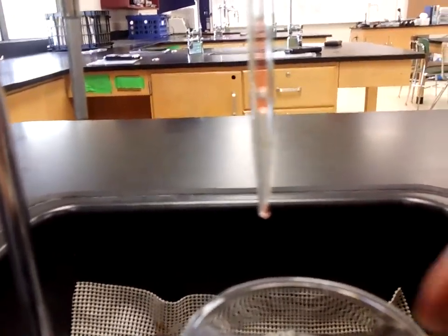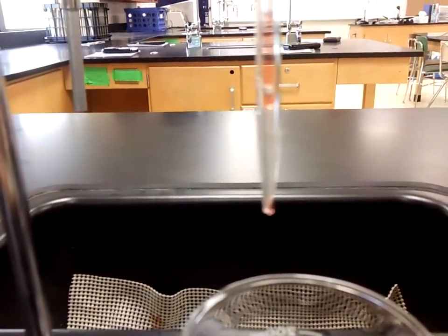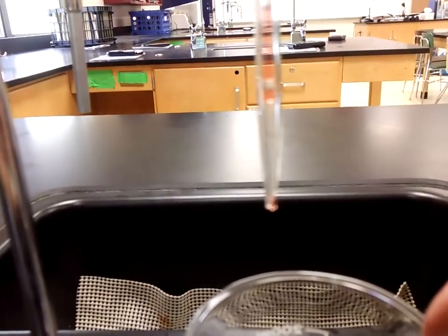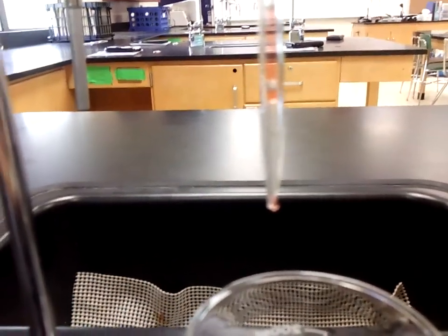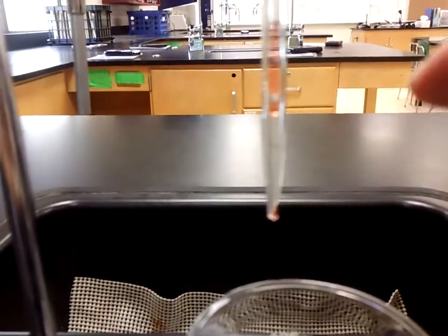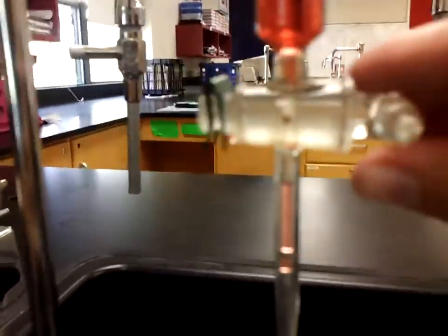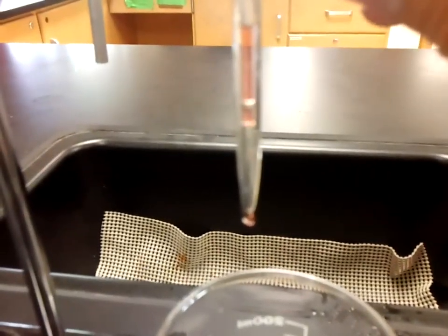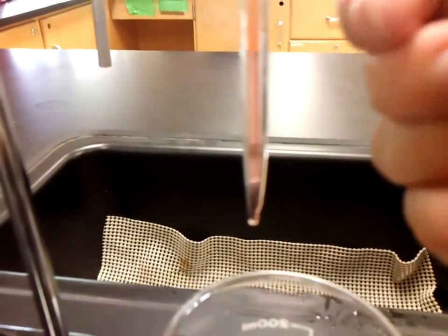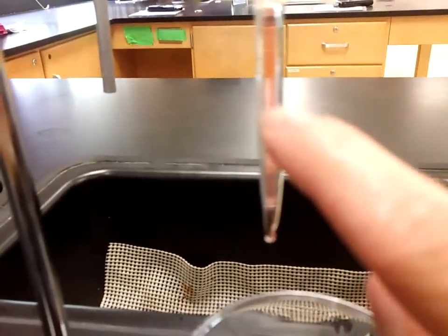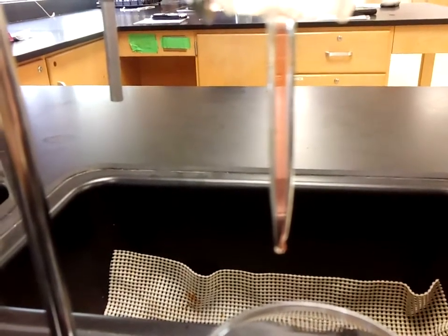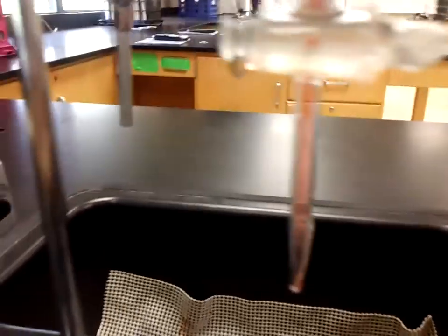Once again, that volume is not going into your beaker, your Erlenmeyer flask, or whatever your reaction is, it's going through the tip. So please make sure that when you start, before you fill it, before you take your first volume reading, you want to go ahead and make sure that you drain some of this off, and you can drain it into the sink, you can drain it back into your initial container, but that your tip of your burette should be filled all the way with liquid before you start.